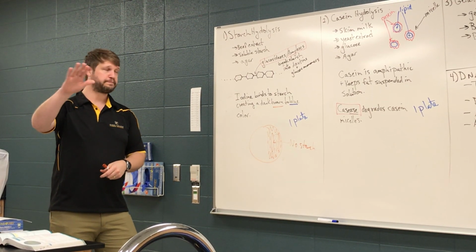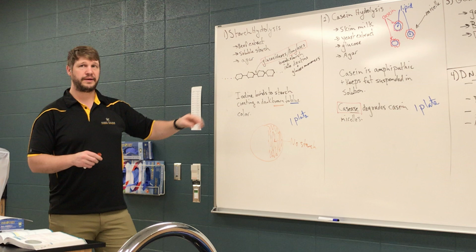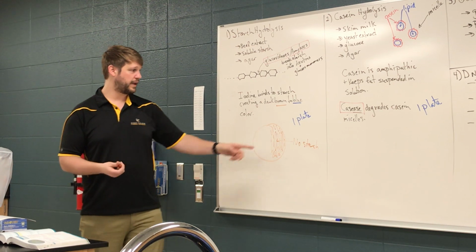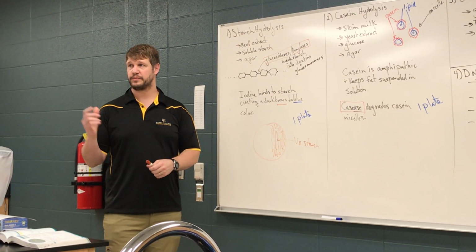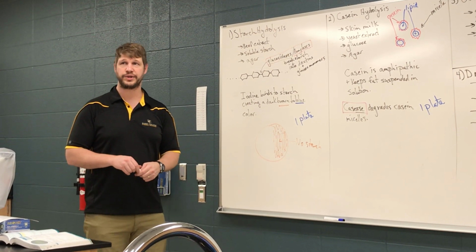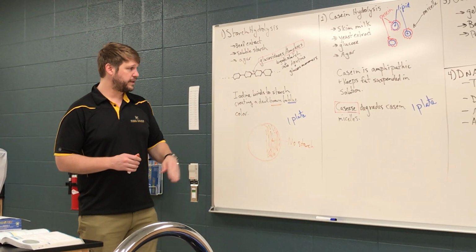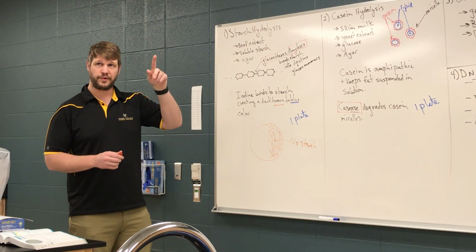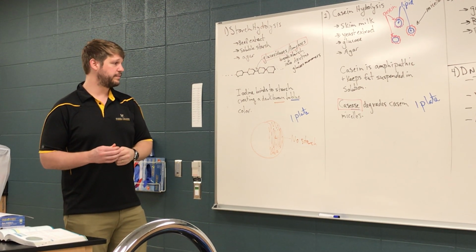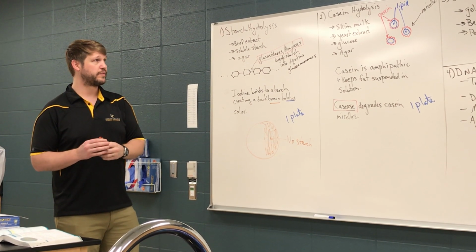So you'll streak the plates, you'll let them grow for 24 to 48 hours, come back, add the iodine, let it sit for a little while so the iodine can soak down into the media, and look for a halo. Right? There's a nice picture in your textbook of what this looks like, so you can see that if you're questioning your interpretation of the media. For this, you can use one plate for all 4 of your organisms, just as before, divided into quadrants, right? And identify which quadrant is which organism. Should be good to go. It's generally a fairly unambiguous result.